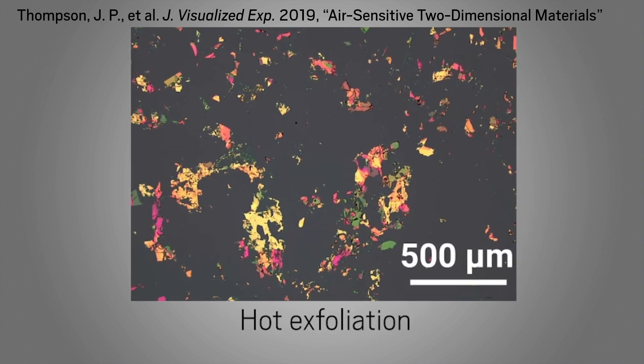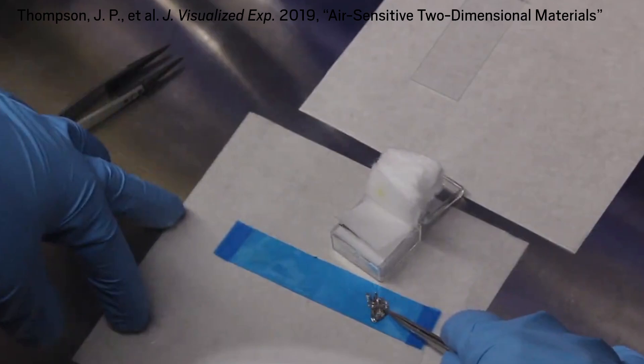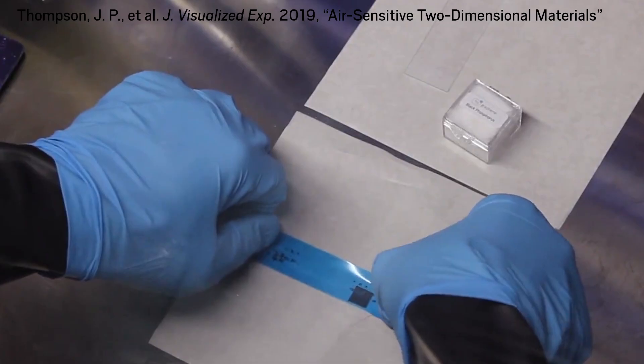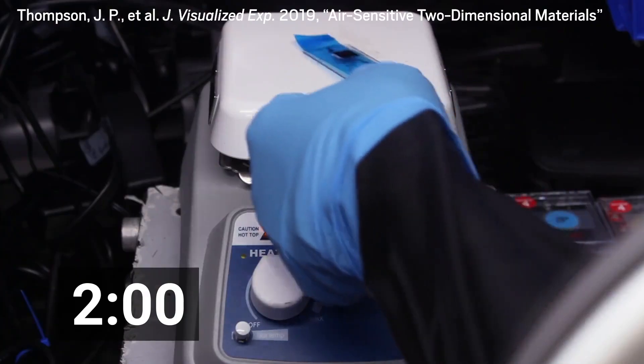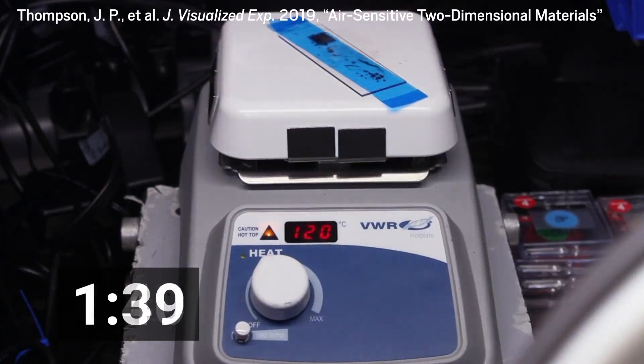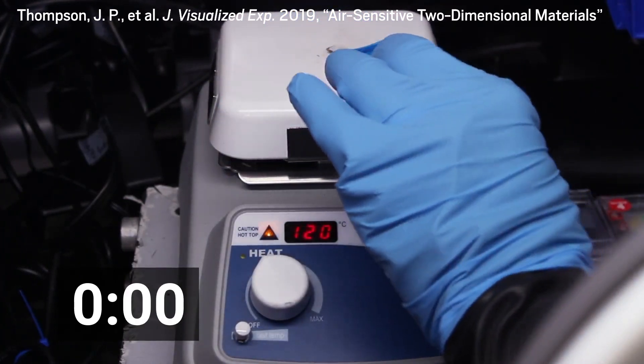Hot exfoliation, which involves heating a peeled material to help it bond to a substrate, can create larger flakes. The team separated flakes of black phosphorus using adhesive tape, then stuck the tape to a silicon chip. Heating the black phosphorus sandwich drives out gas bubbles, increasing the contact area between the sample and the chip.